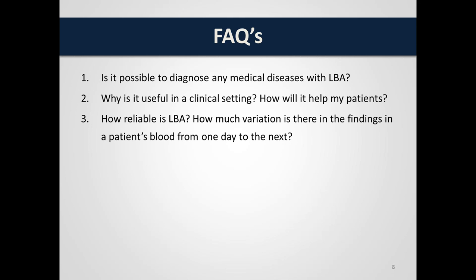Patients tend to present with a very specific mix of anomalies that don't change unless the appropriate course of treatment is completed. So they would have had a list of perhaps 10 anomalies at the first appointment, and if they don't make the necessary changes, we will then see the same 10 anomalies when they come back, even if it's several years later. It's almost like a metabolic or functional fingerprint that we're seeing, and it won't change unless very specific steps are taken to address it.